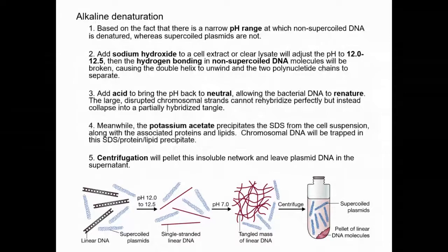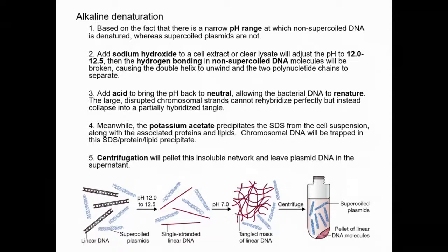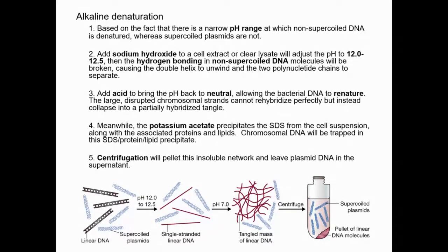Okay. So the plasmid DNA are circular DNA, and because it's circular in the natural environment, it will form the supercoil, and that's because of the physical difference. Yes, that's a physical difference. The conformational difference is a physical difference between the plasmid DNA and the genomic DNA.